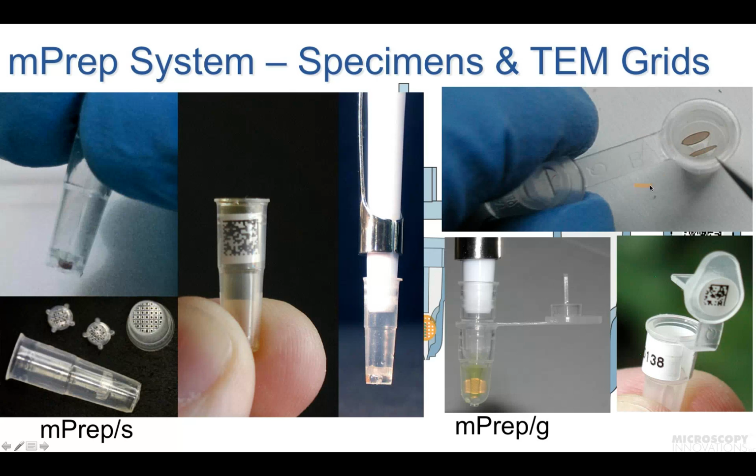They're labeled A and B, as we can see here. These capsules attach directly to the pipetter. Here we have a grid being stained with uranyl acetate. The grid looks a bit oval here because the plastic acts a little bit like a lens, so it distorts what the grid looks like. And here we see the labels on these.